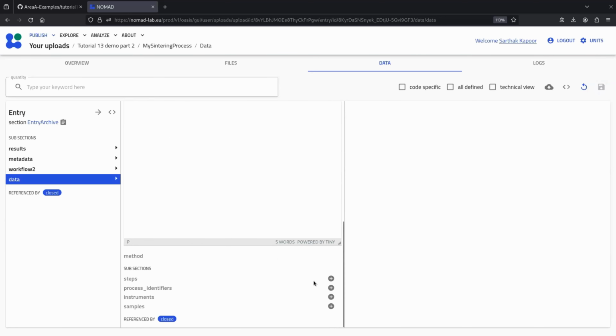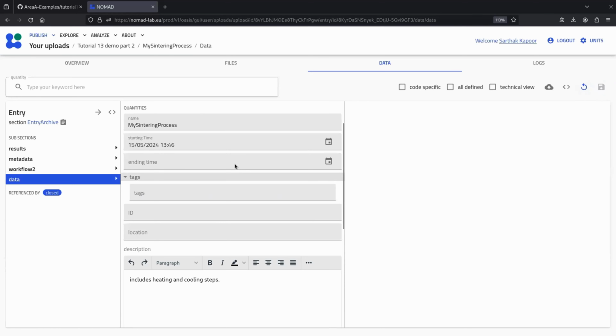Sorry, where do you hit save? Like, how do you save that? So the save button is here. If there is something to be saved, the floppy kind of button here, which says save entry, we just simply click it and it saves.